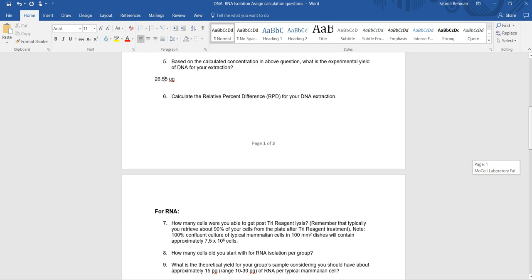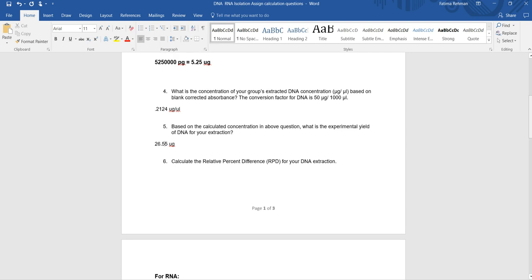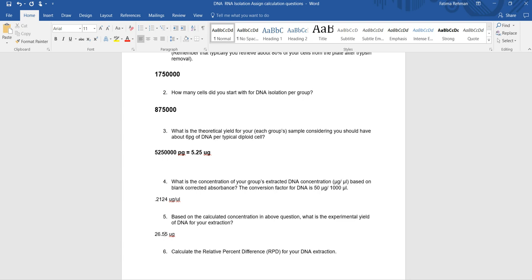So make sure that you're using the right conversion factors for the right thing. And also make sure that you take into account the dilution factor, which I had forgotten to do in the last video. So make sure that you take into account that value as well.